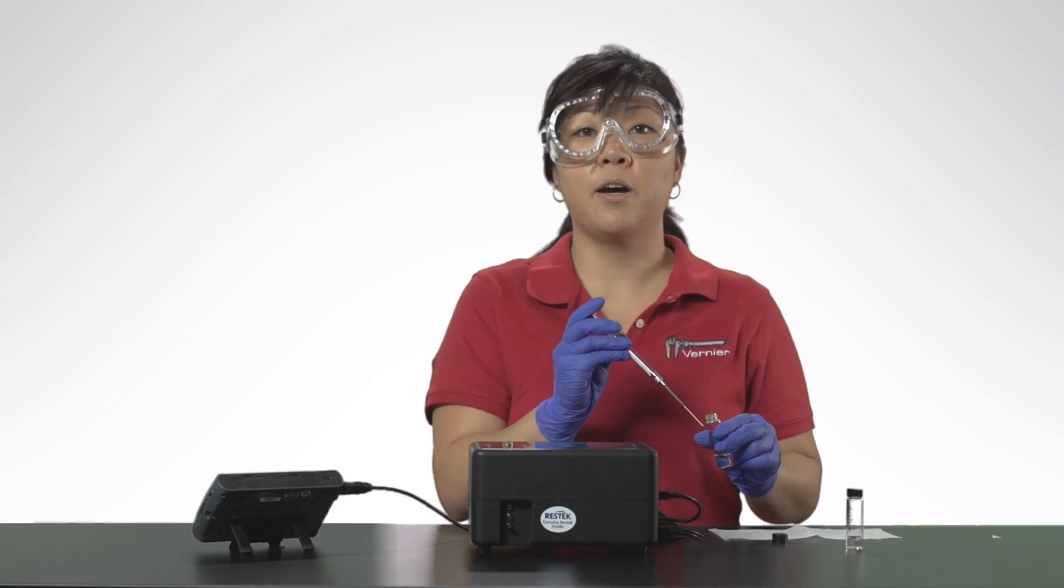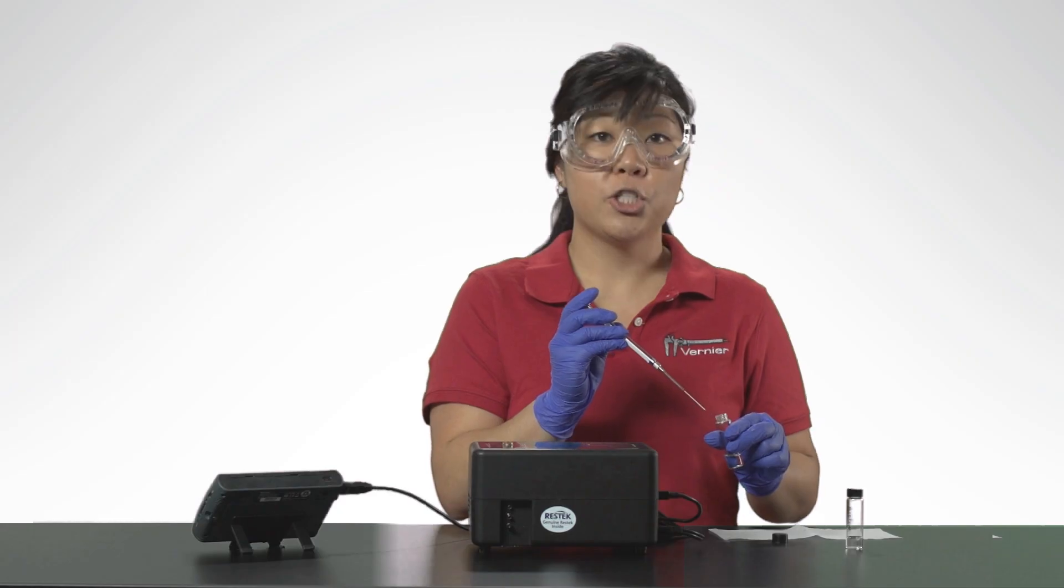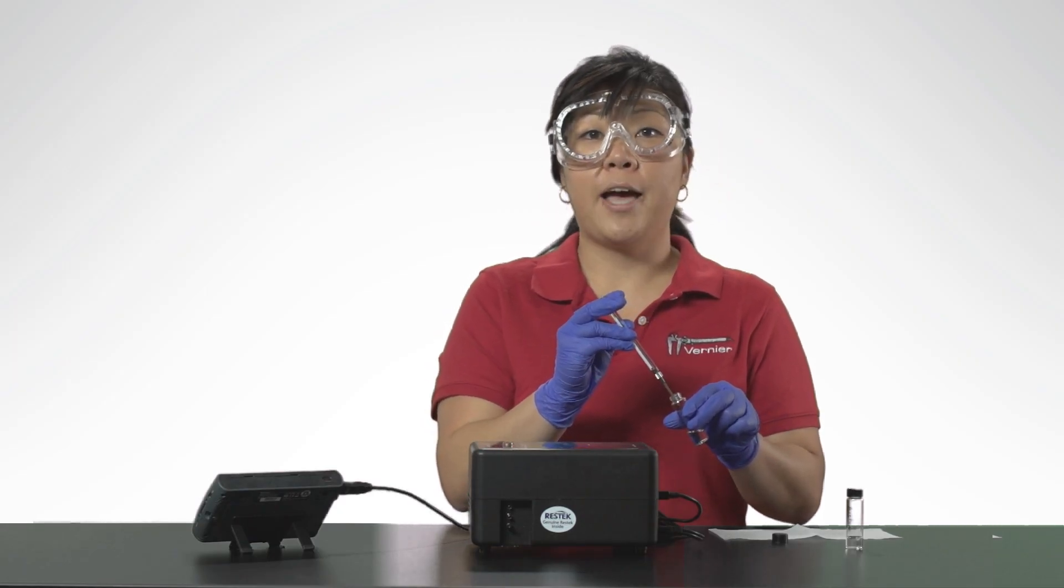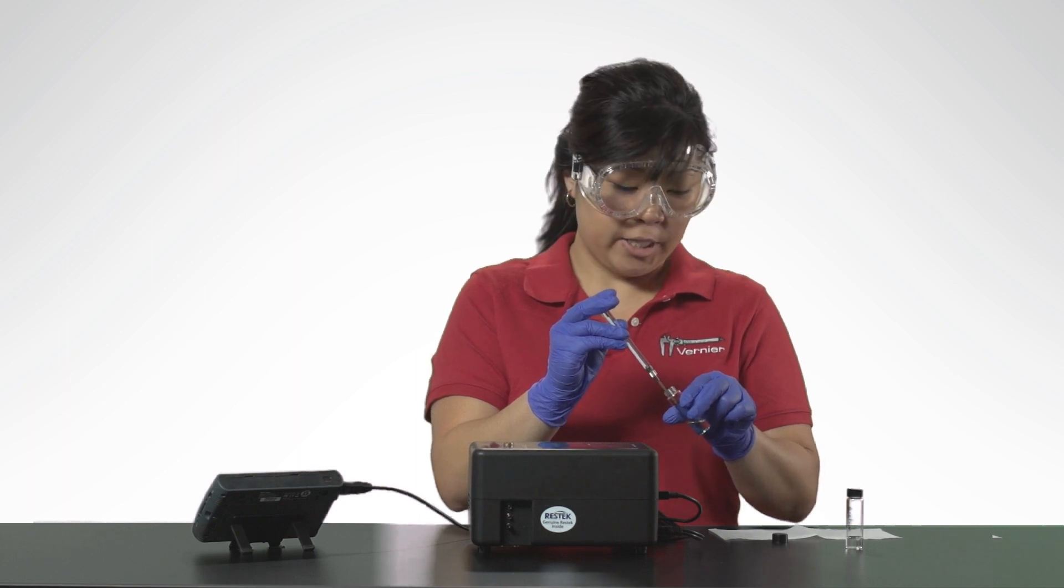Then collect the volume of the sample for injection. Submerge the needle into the vial containing your sample. Pull your plunger back approximately 0.2 microliters of liquid.